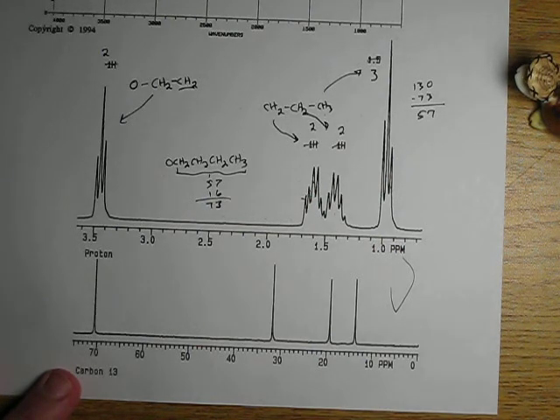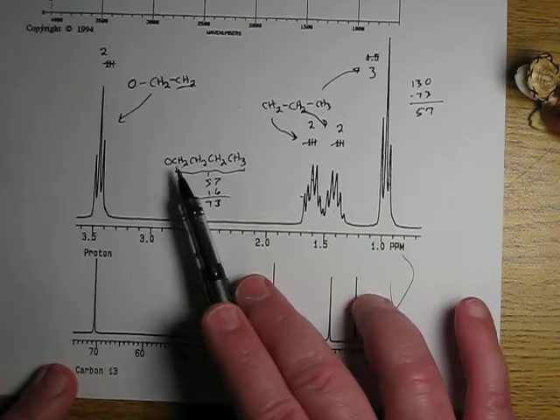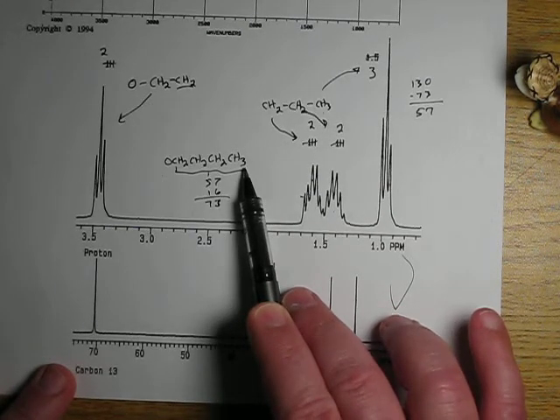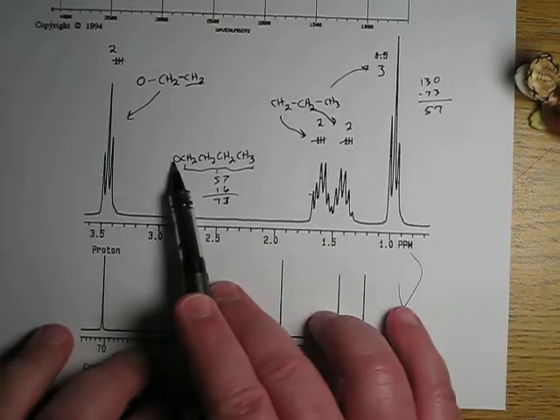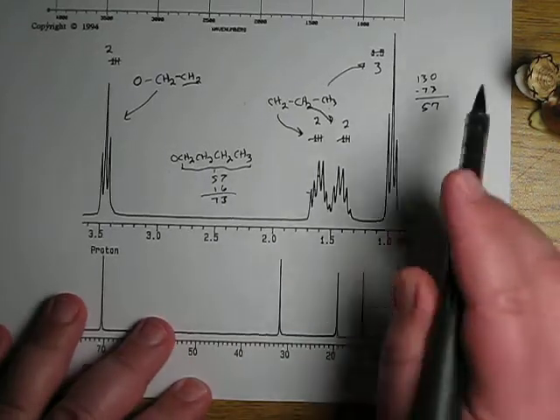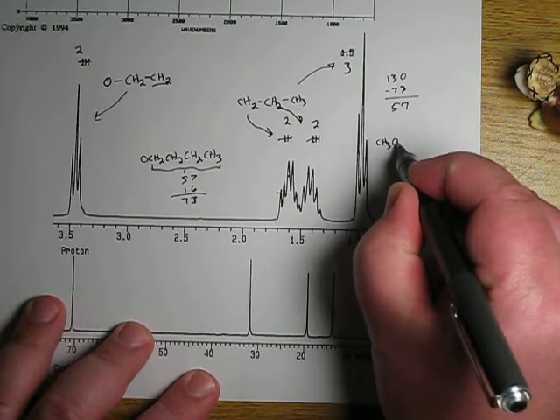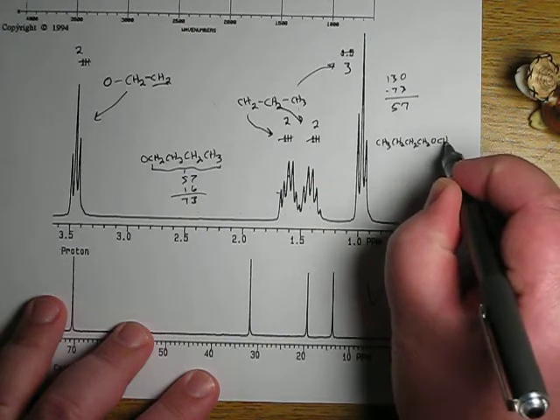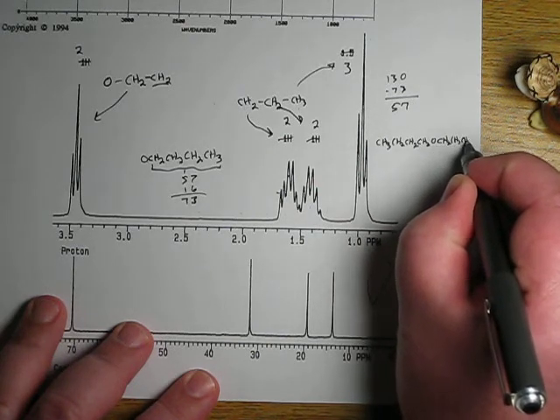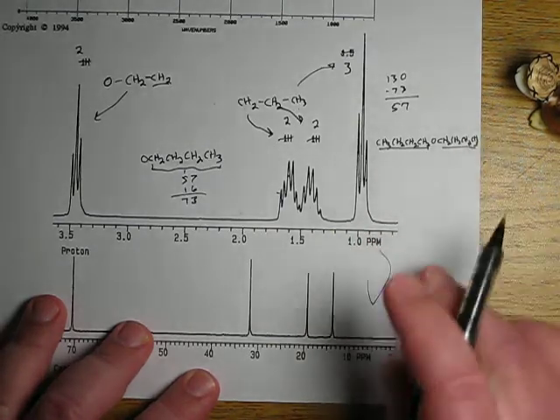And then we realize, oh, but what? I've seen that mass of 57 before. Where have I seen this 57? It's this. It's the mass of a butyl group. What this means then is what's on the other side of this oxygen? Another butyl group. So this molecule is actually CH3, CH2, CH2, CH2, O, CH2, CH2, CH2, CH3. It's a butyl group, O, it's a dibutyl ether.